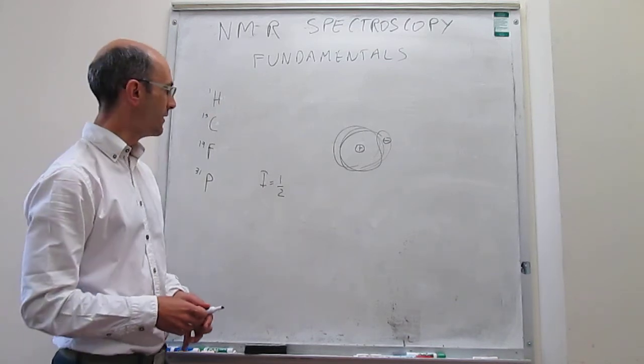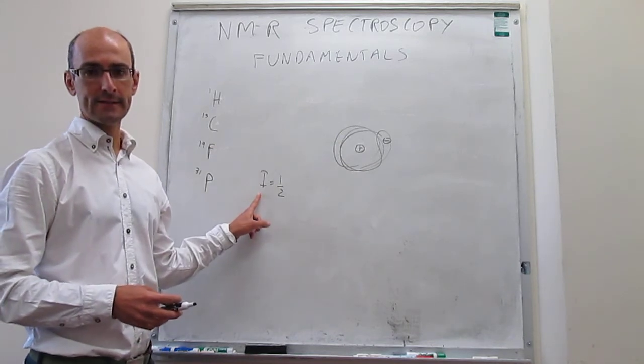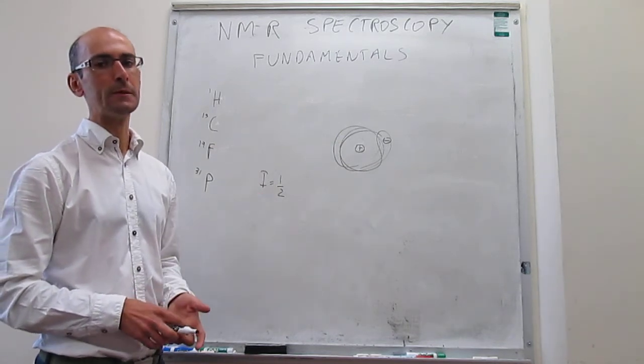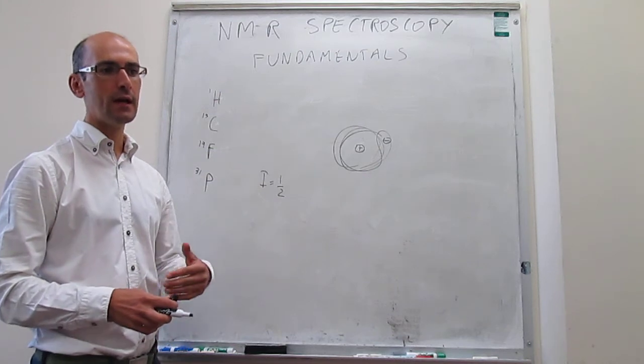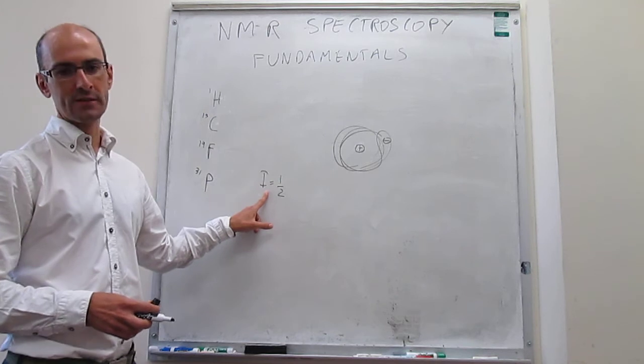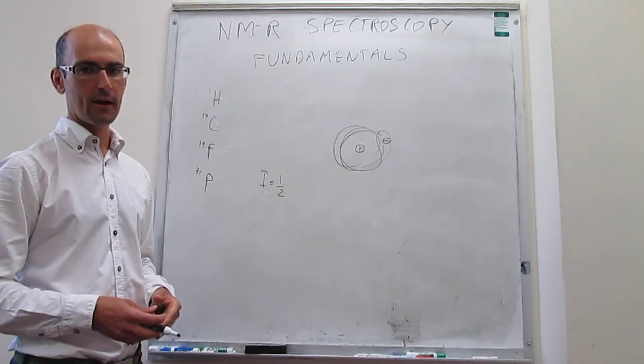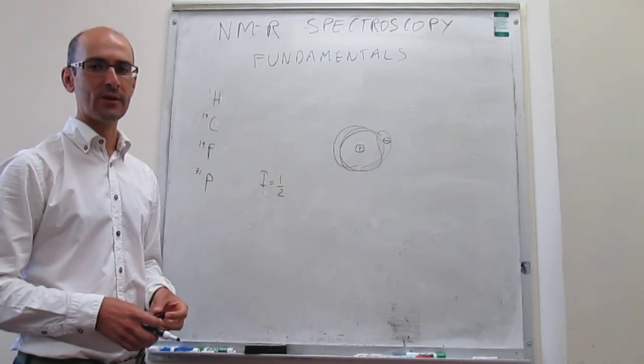Again, the rest of this chapter on NMR spectroscopy is going to be invested in trying to see how nuclei like these, that are NMR active and have a total spin of 1/2, behave, and how you can actually do NMR spectroscopy with them.